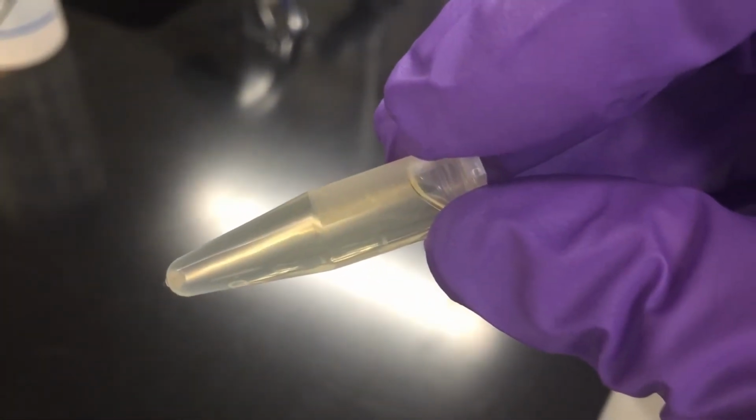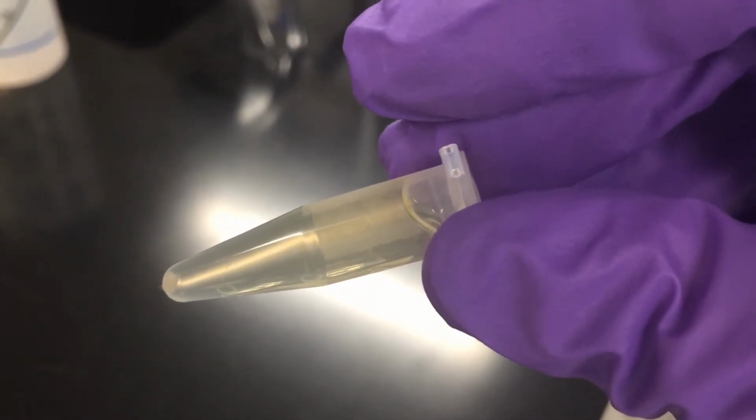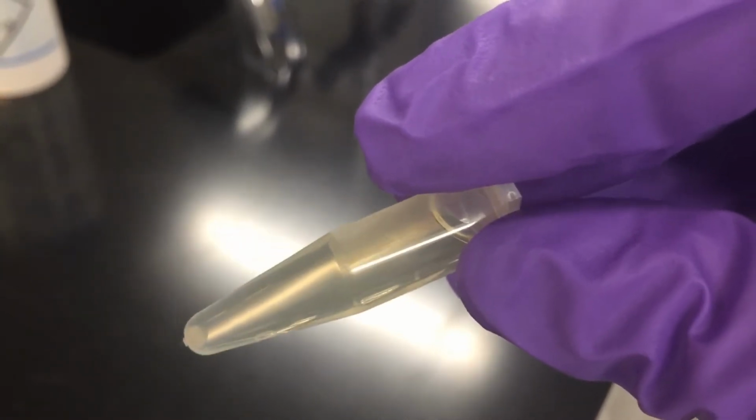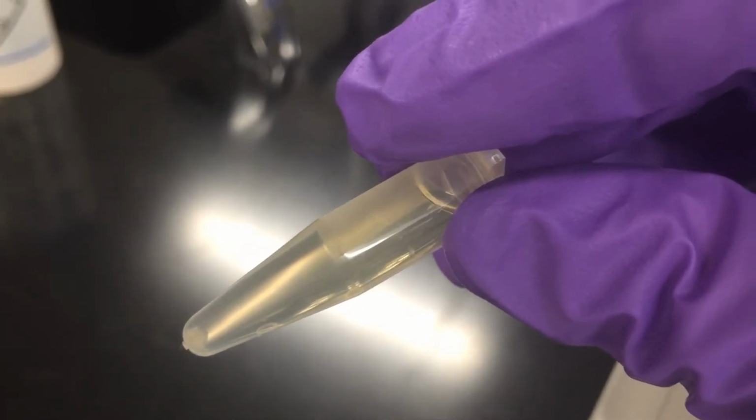Now if you take a look very carefully, there's a small amount of E. coli in that test tube. So what I'm going to do is pour off the liquid supernatant, and I'm going to basically repeat the procedure in order to try to get a larger pellet. And I'll show you what that pellet looks like at the end of that procedure.